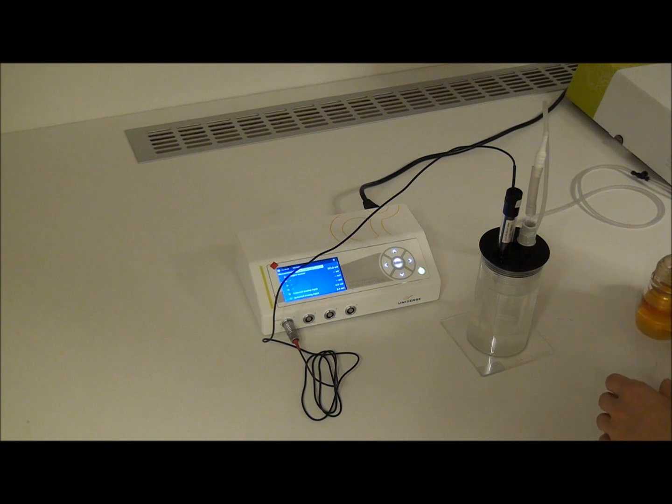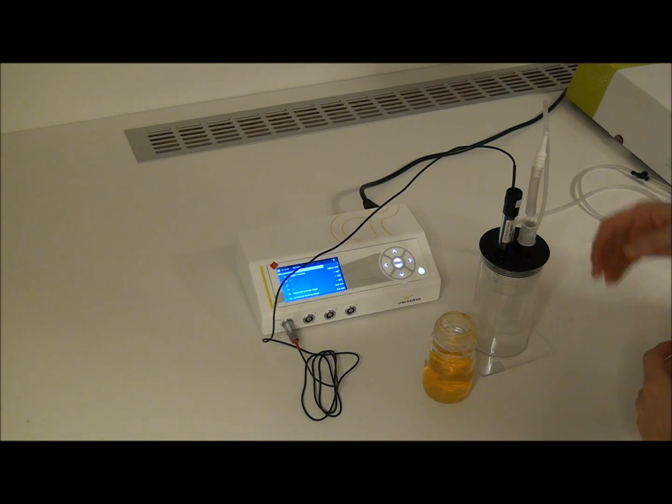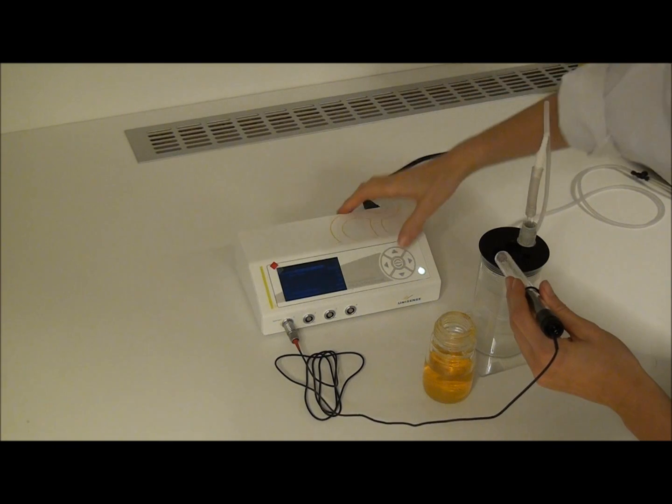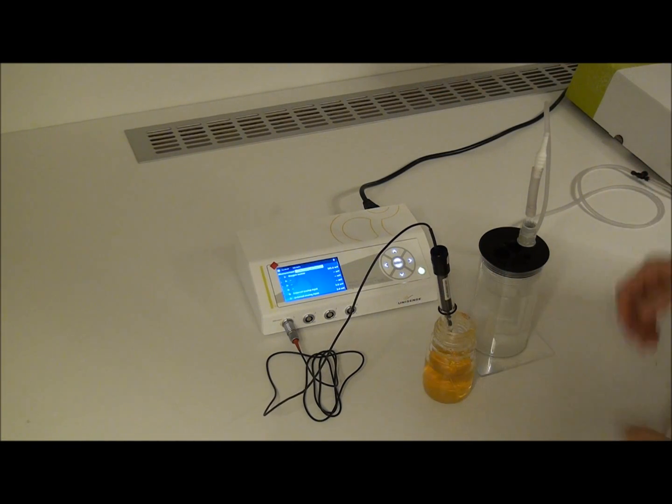The second point will be measured in an anoxic solution. Here I am using ascorbic acid as described in the manual. You will see the sensor signal come down immediately when placing the sensor in the anoxic solution.